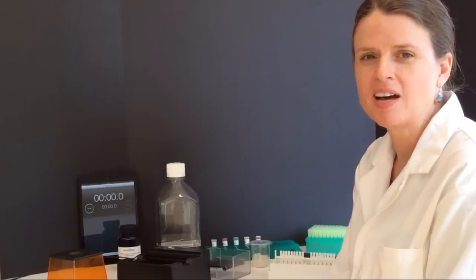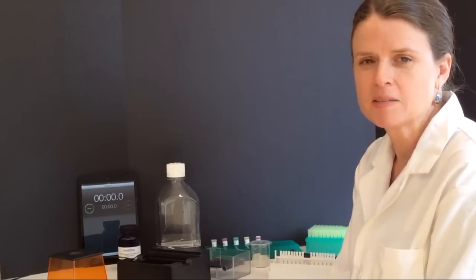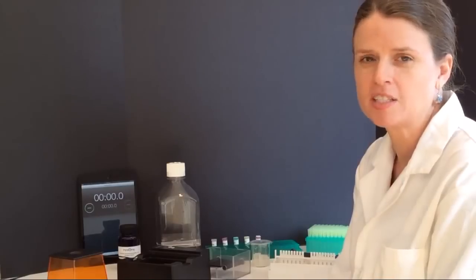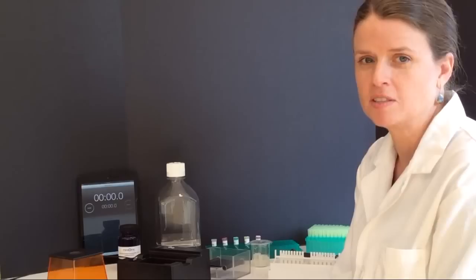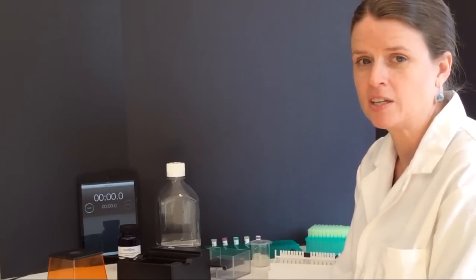Hi, I'm Maggie. I work with a lot of teachers who are just getting started in biotechnology. One of the biggest complaints I hear from teachers who are trying to do electrophoresis in their classrooms is that the equipment is really difficult to use with their students. I also hear a lot of complaints about how long it takes to run a gel in class.